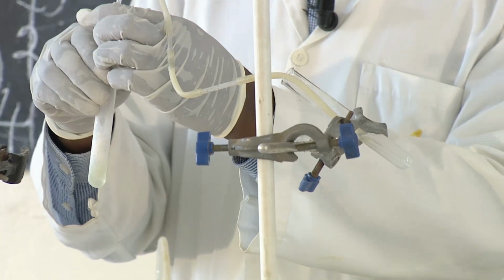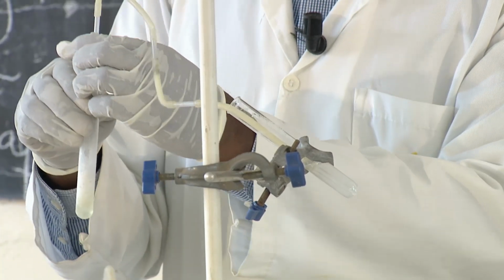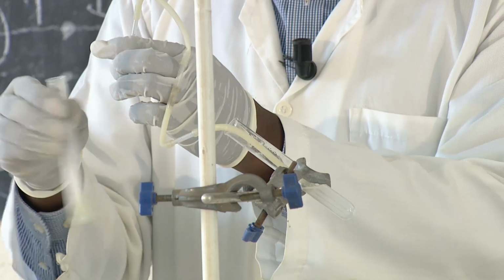When you look at the solution, remember we formed the milky solution first.